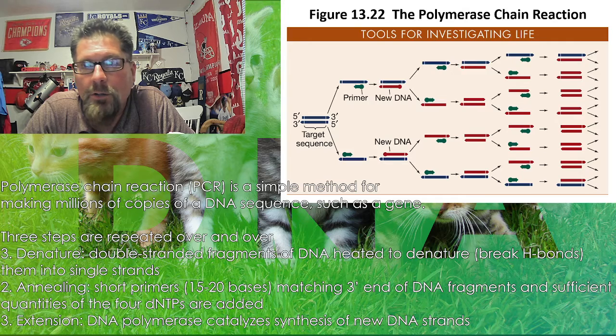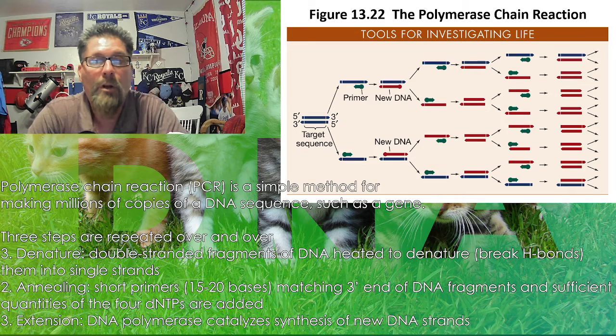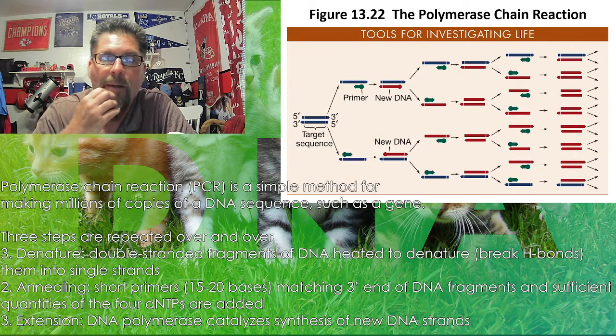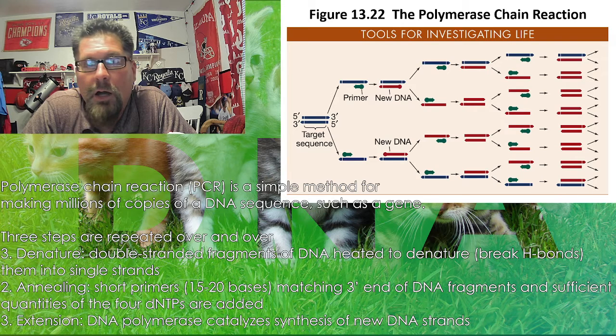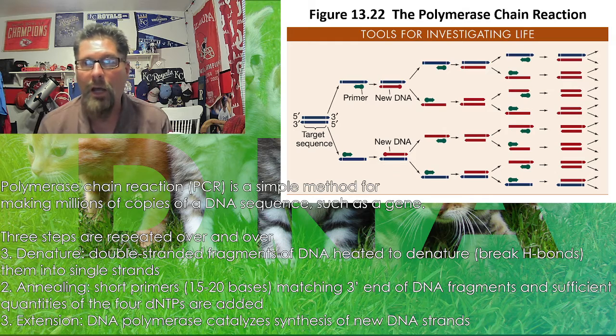So simply what we've got going on here is we've got our DNA that we want to replicate. Well, that DNA is denatured. Now obviously the cells do it naturally, but when you just have a DNA strand in solution in a test tube and you want to replicate it, it's not going to go through its regular process, so they denature it so they can separate those two strands, just like it would, and you've got your 3' end, your 5' end, just like under normal situations, and they are able to put a primer on there, and then the process starts making that DNA.